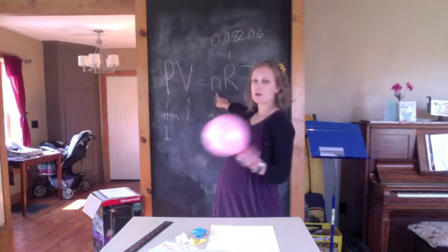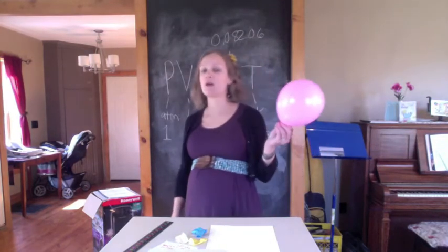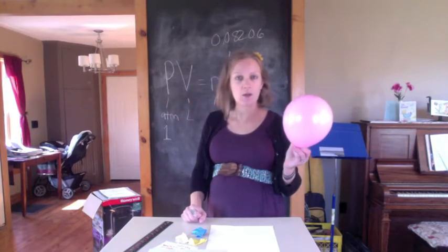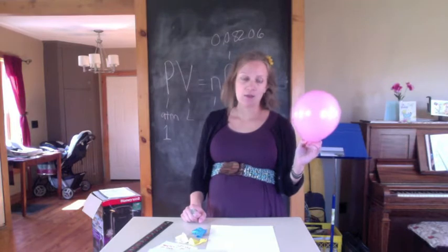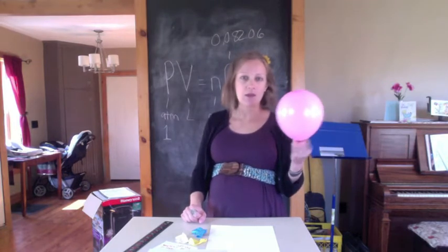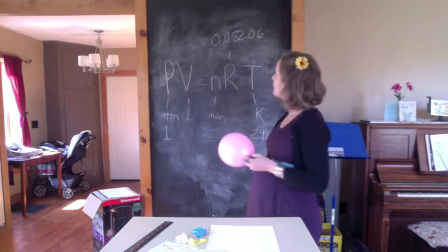So you can think ahead if you can guess how many moles this is. It's not too often we think about moles of air and how much space those take up. So you can make yourself a hypothesis ahead of time and guess how many moles of air might be in this balloon. That will be fun. You'll find out if you're right at the end.